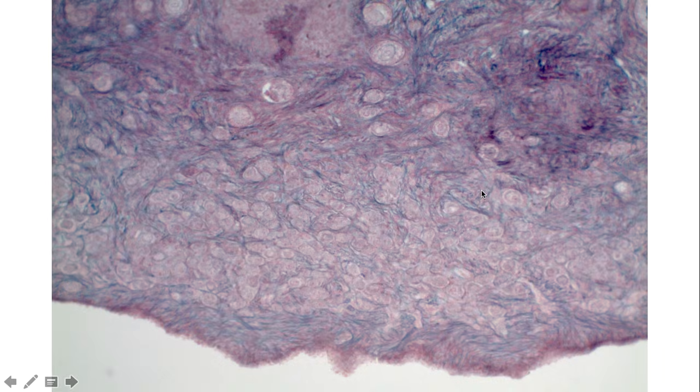If we look at some of these in a little more detail, first, around the outer edge, we can see a bunch of these very small follicles. A lot of them, if you can see over here, have really only a single layer of cells that surrounds the oocyte. So these are all the primordial follicles. These are the ones that a female would have at birth, maybe a million or so of them, all arrested in a very early stage of meiosis. So there's this single oocyte, typically surrounded by a single layer of cells. These are all these small follicles here.